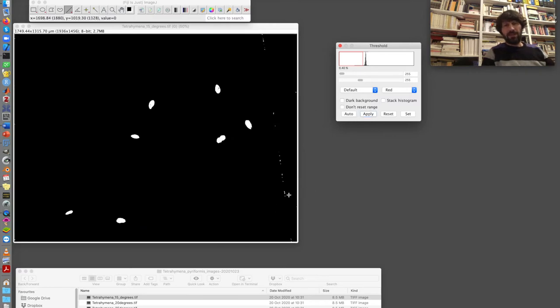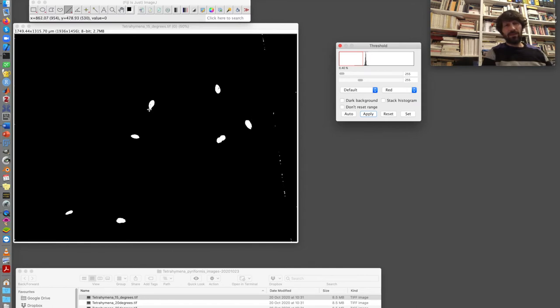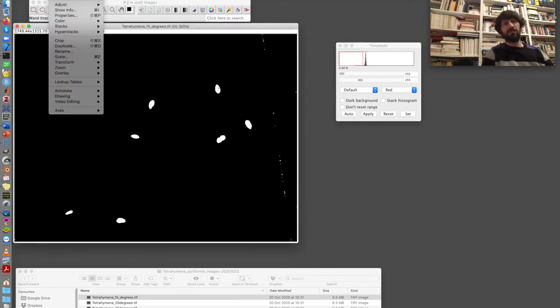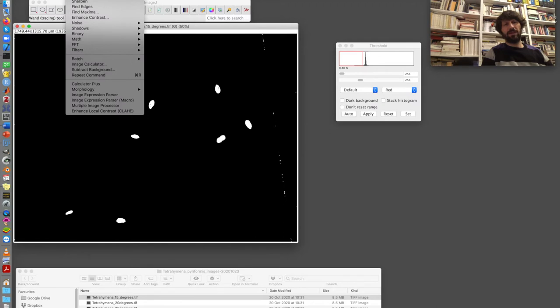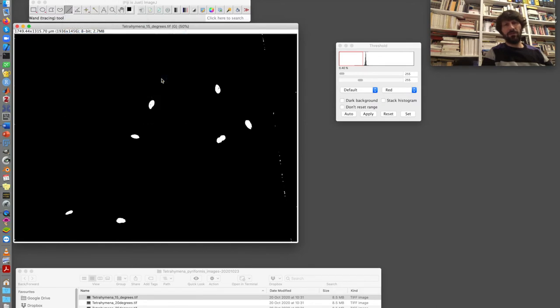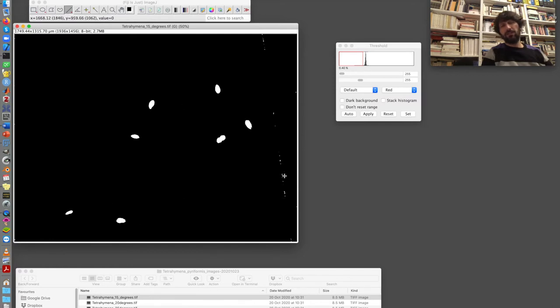In this case, there are a few isolated pixels here that have remained. And then the Tetrahymenas, which are quite good, but there are a few holes. So I go to the binary filters, process binary, fill holes, and I fill the holes inside the Tetrahymenas. And then I will need to take care of these isolated pixels at some point.